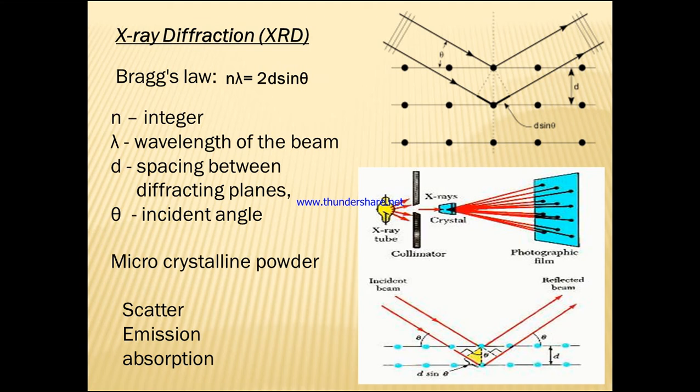Typical powder patterns or data are collected in terms of 2 sine theta or 2θ, from an angle of 5 degrees to 70 degrees in the X-ray scan here. For all these angles, we are going to have a different element or powder of compounds. Based on that, we can analyze the material here. That is what we call X-ray diffraction.